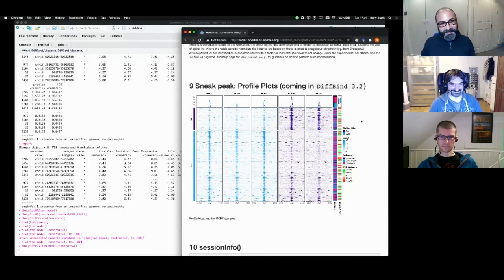And that's still the case. It's 15,000 lines of R, but it doesn't do anything. So it doesn't do anything that you can't do yourself if you have a very good command of R and probably about 14 underlying packages at this moment. But if you're just trying to analyze a ChIP or ATAC experiment in the most straightforward way possible, this is it.